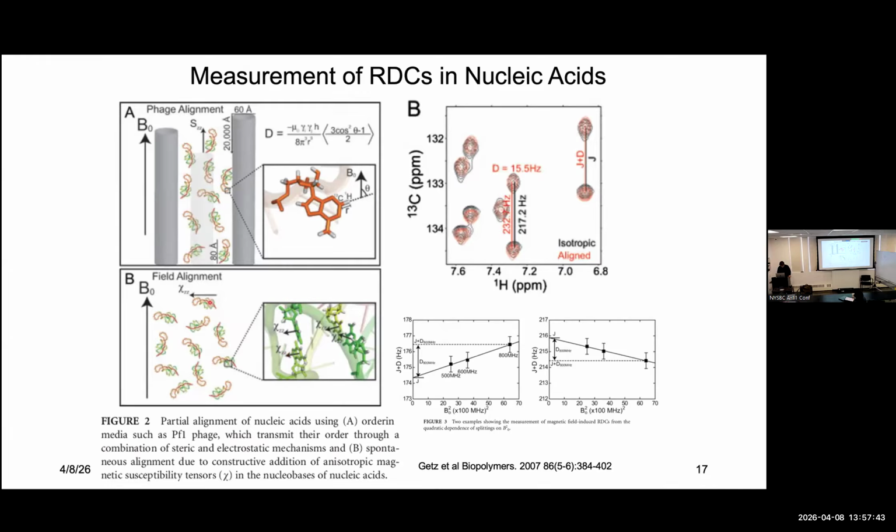And as I mentioned before, because it's diamagnetic, it likes to be perpendicular to the field. So when you align an RNA magnetically, it will be perpendicular to the field. Whereas sterically, if we go back to my example, the most likely alignment for my pen is to be parallel.